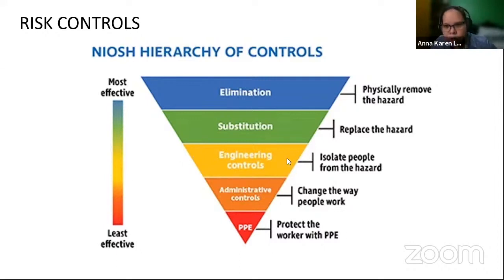For engineering controls, dito papasok yung mga equipments that are available in the lab, such as, of course, in biological safety. Considering biological safety, if you're working with microorganisms and different biological agents, you have different biosafety levels, and different requirements for the different biosafety levels.